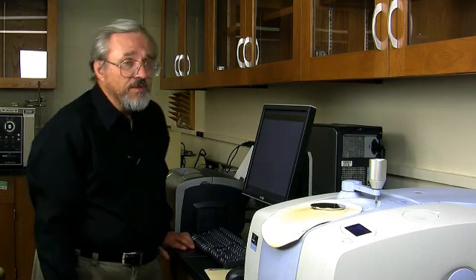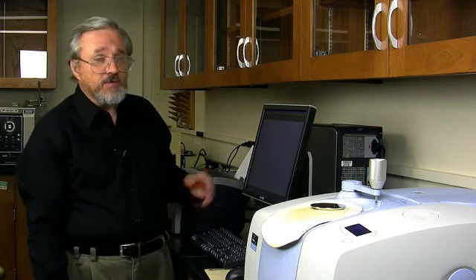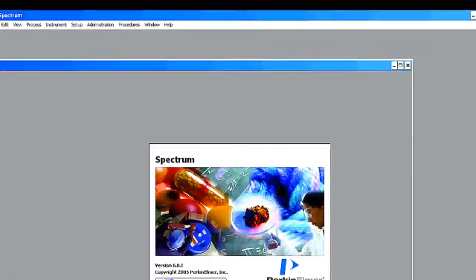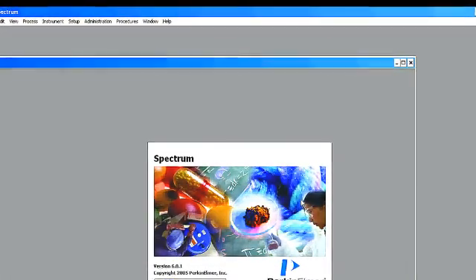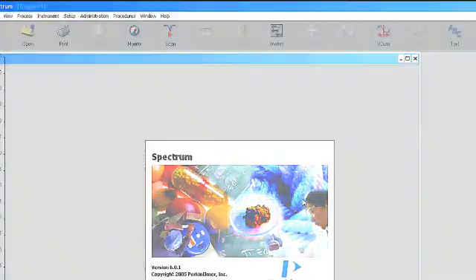Here we have the screen that we're going to be operating off of. This is where the IR spectrum is going to be revealed. It's a very easy operation.